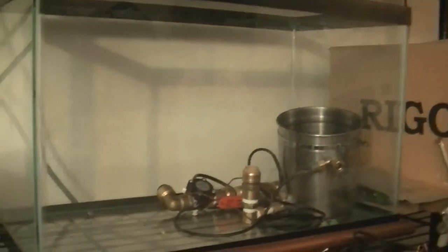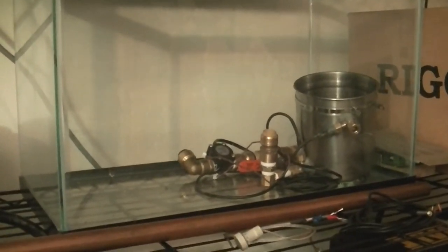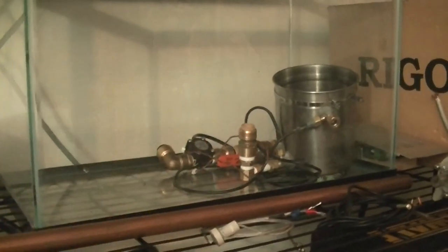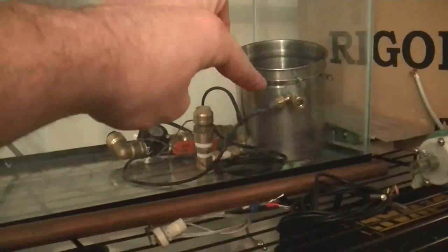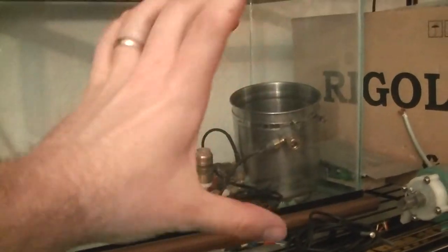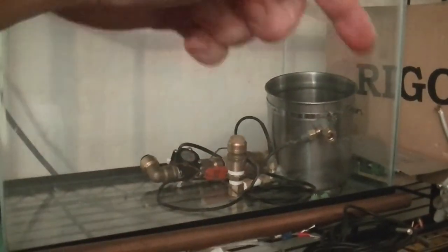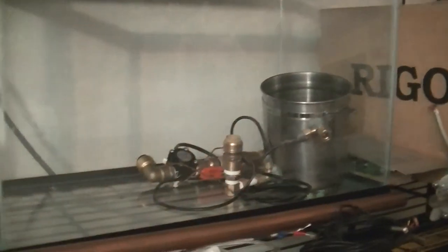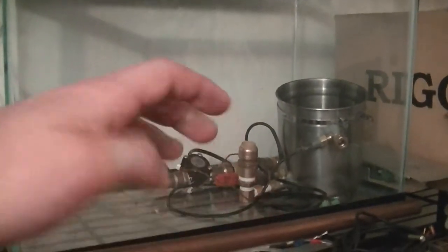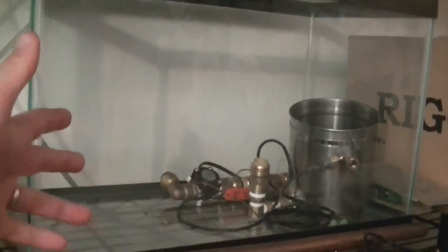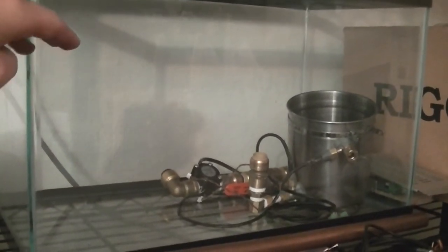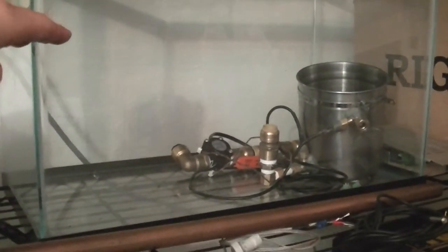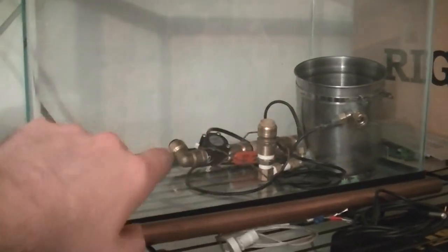And so the principle of my calorimeter, which has been very slow going. And I'm gonna switch to Pyrex to reduce the thermal mass. There's gonna be an inner reactor and this is the outer reactor. And I need to get some porcelain tile that will encapsulate it, and then screw it down. That's the plan anyways for that. Put some insulative feed throughs.